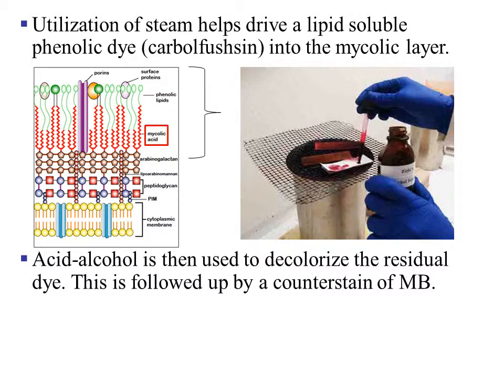Steam will have to be used to help drive this lipid-soluble phenolic dye into the mycolic layer. Acid alcohol is then used to decolorize the residual dye. This is followed up by a counterstain of methylene blue.